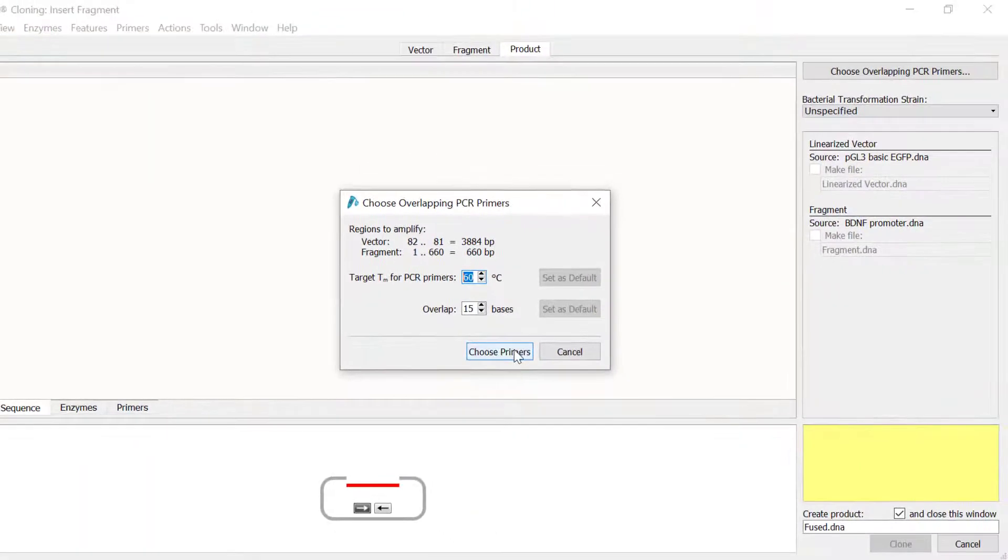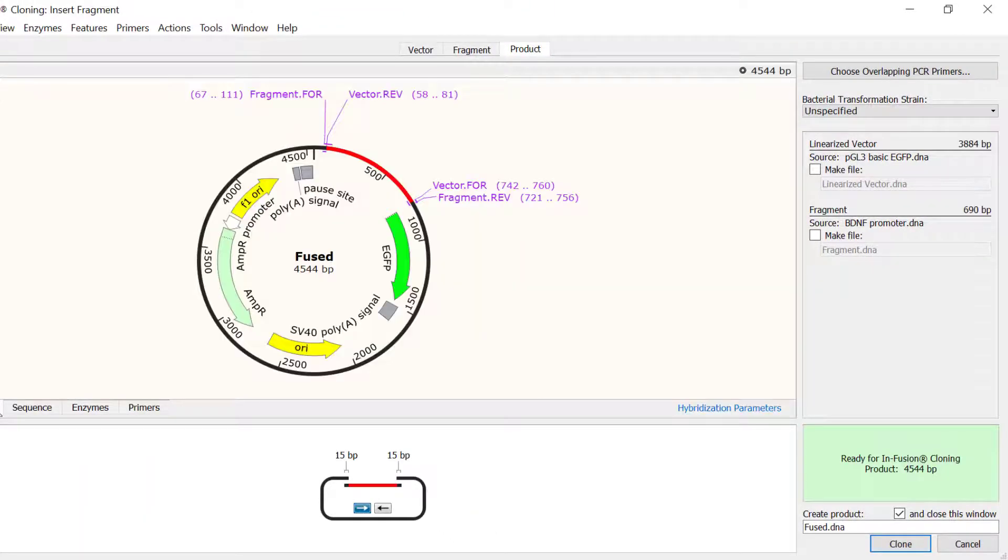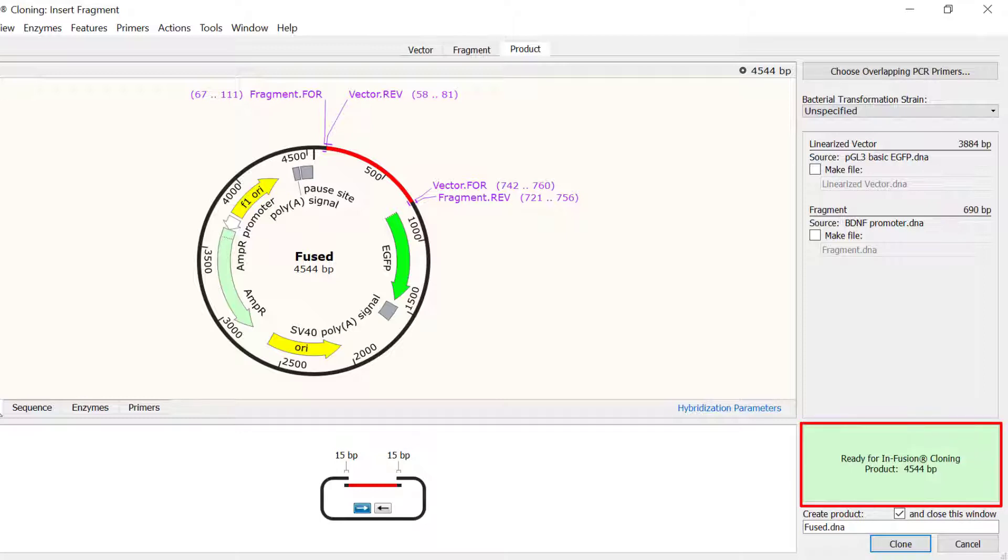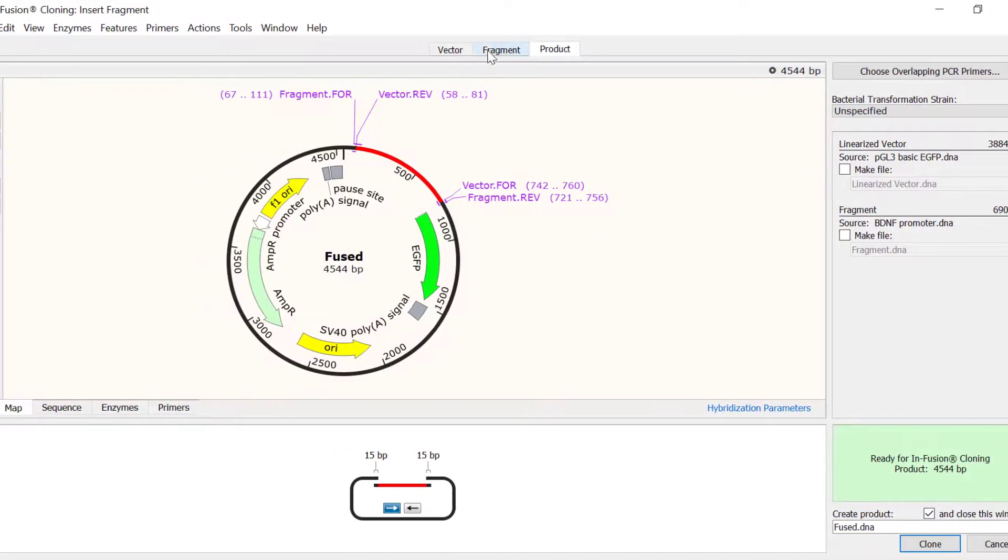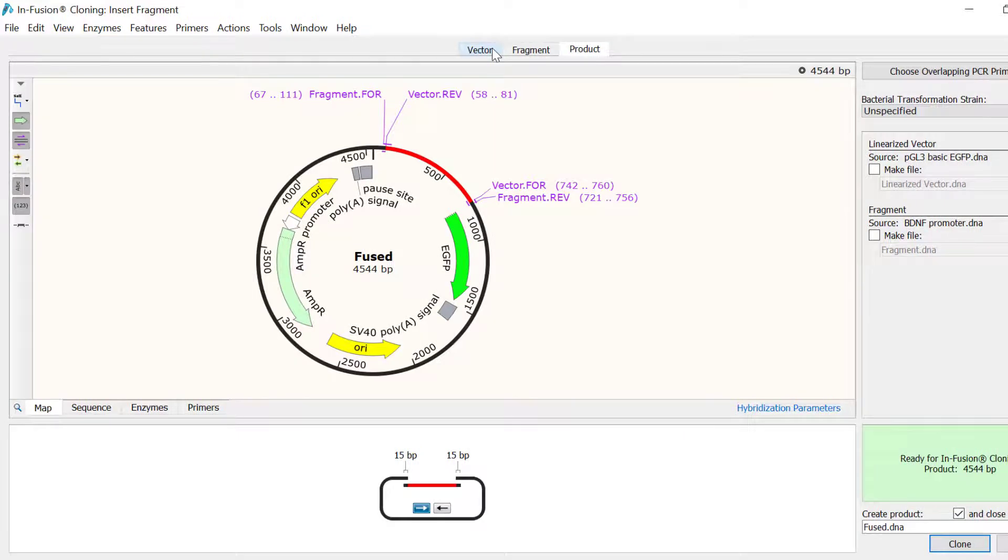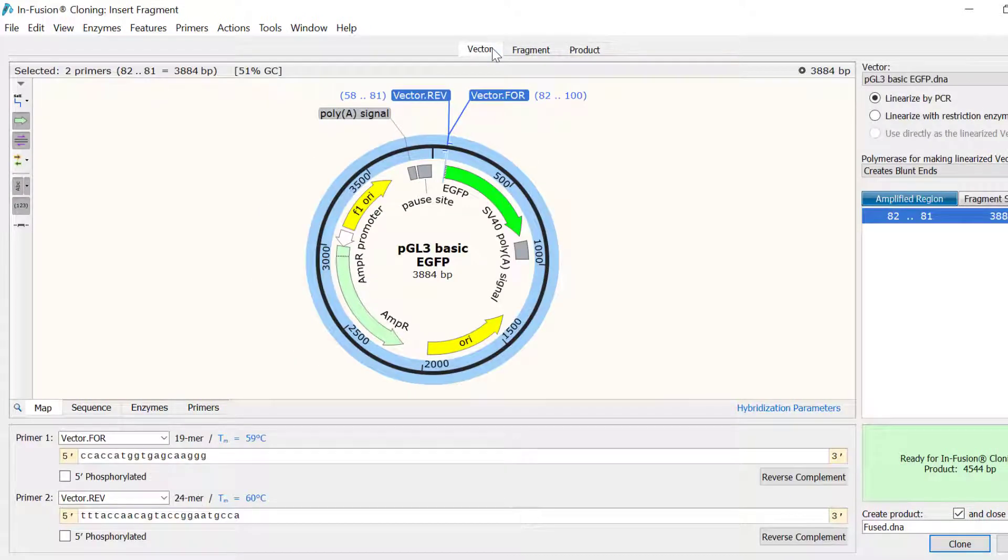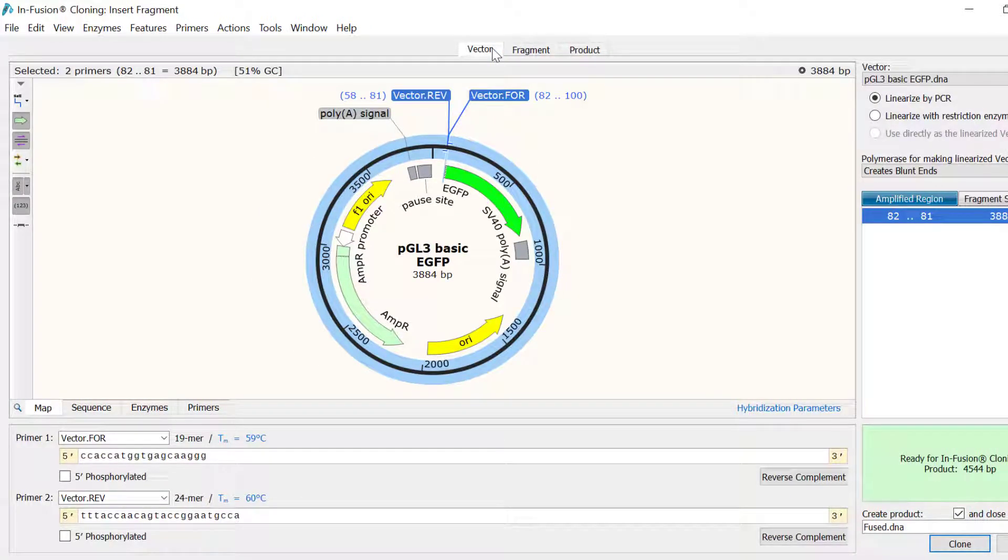The resulting products can now be previewed in the product tab. As you can see, this is 4544 base pairs long. By switching back to the vector tab, I can see that there are two primers named Vector.FOR and vector.rev that start at the insertion point I selected earlier. The result will be a linearised plasmid.